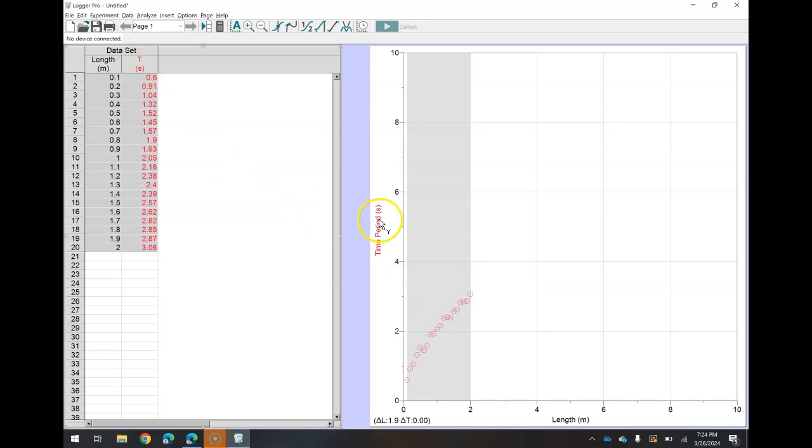And now, if you don't like the order, it's really easy at this point to change what's on which axis. You can just click the name and click the other data column, and it'll put it for you. So if it pops up in the wrong order, it's really easy to switch what's on what. But I want time period on Y and length on the X-axis.